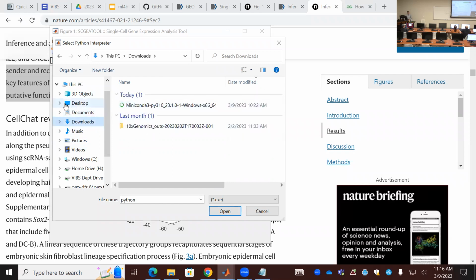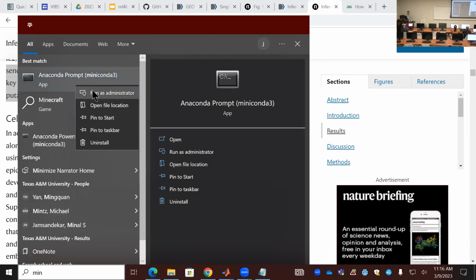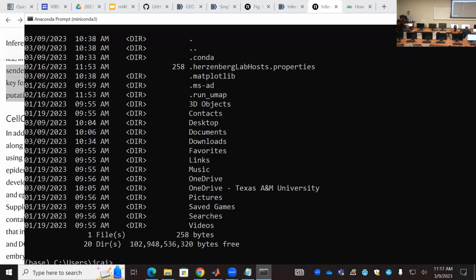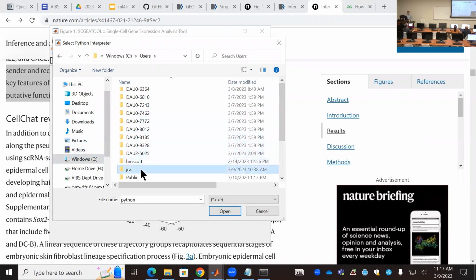No, not this one. Let me see where I installed the miniconda. Okay, I can see, yeah. Okay, I know. It's in C user and found your name.